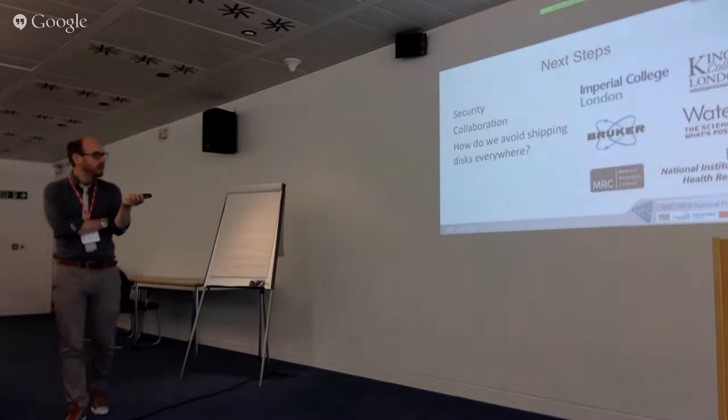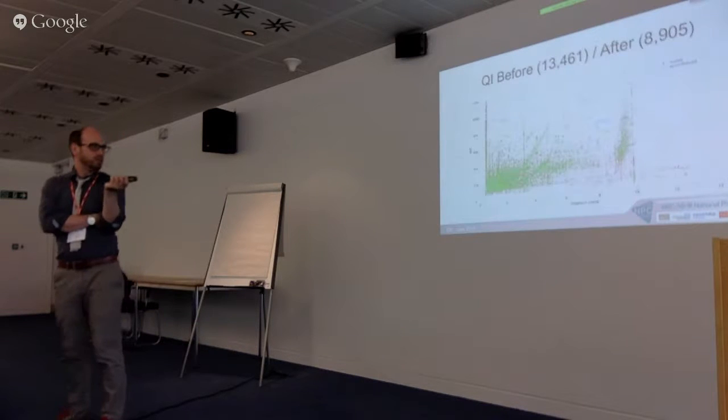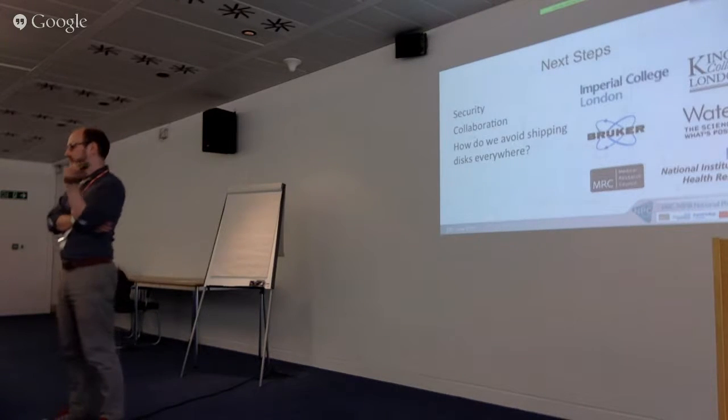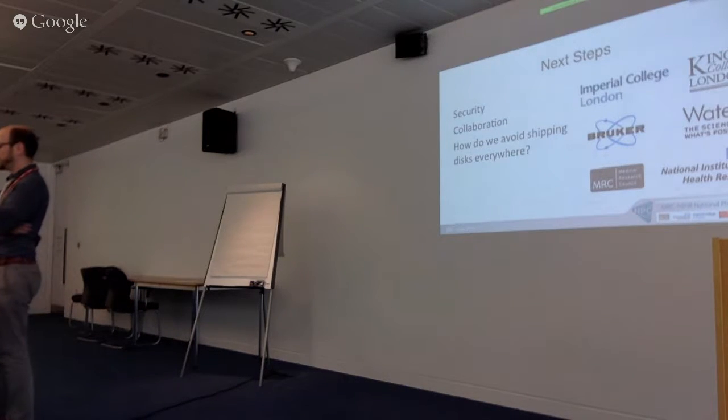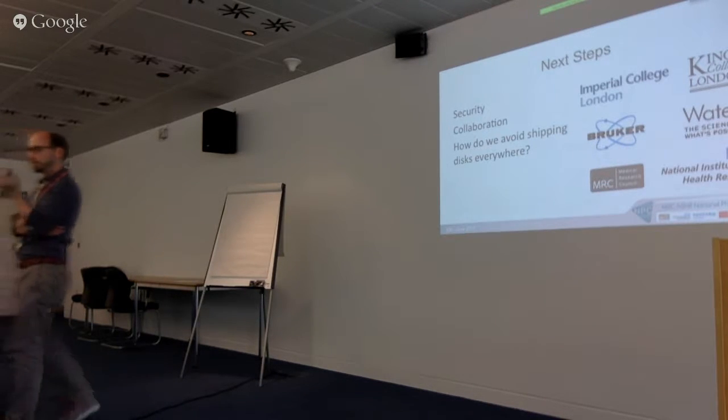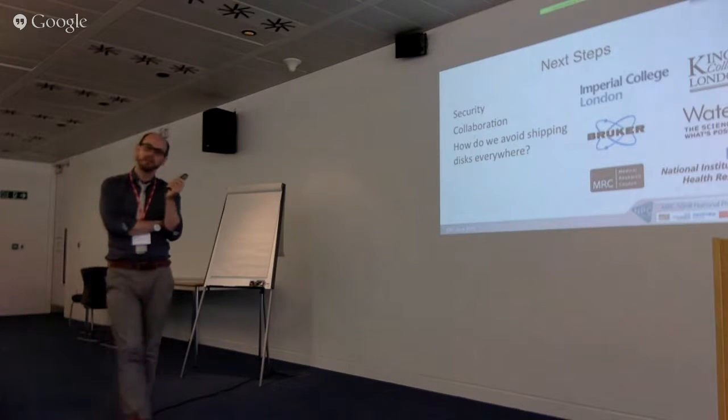But there's certainly the case that you can remove a lot of information from these data files, still keep everything interesting, and easily cut the data size down to a tenth. But that's also dependent on the peak picking you were saying, that maybe in two years' time there might be a more sophisticated way of peak picking.